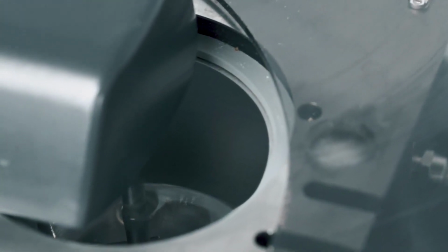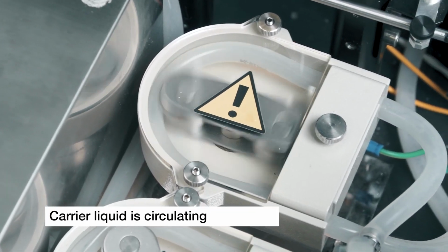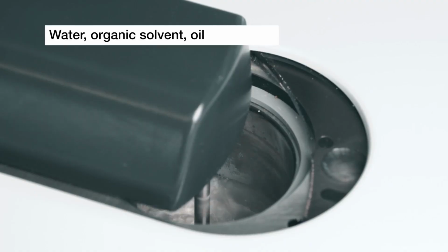Wet measurements are done in a carrier liquid which moves in a closed loop containing the sample tank and the measurement cell. The carrier liquid can be water, organic solvent, or oil, depending on the sample, which can be liquid, creamy, or powdered form.